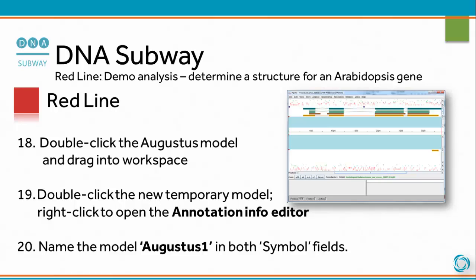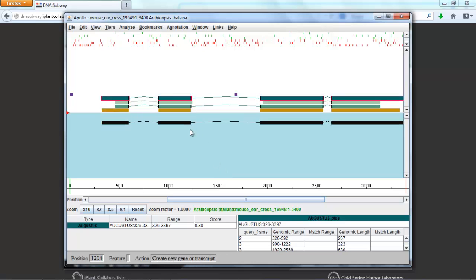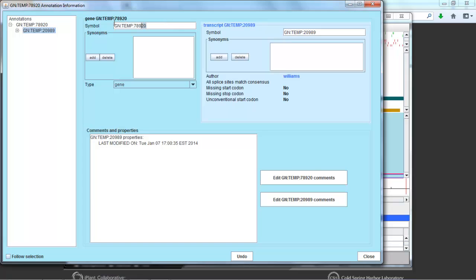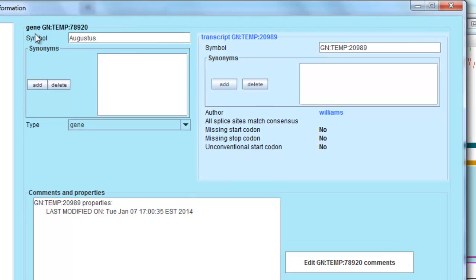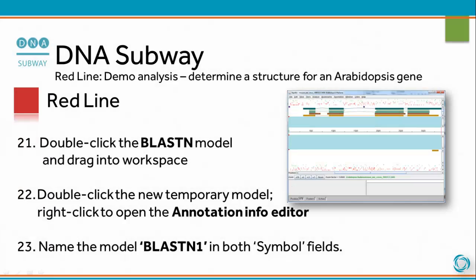Double-click the Augustus model and drag it into the workspace. Double-click the new temporary model. Right-click to open the Annotation Info Editor and name the model Augustus 1 in both symbol fields. Then double-click the BLASTN model and drag it into the workspace. Double-click the new temporary model, right-click to open the Annotation Info Editor, and name the model BLASTN1 in both symbol fields.